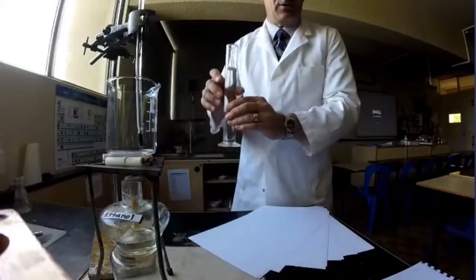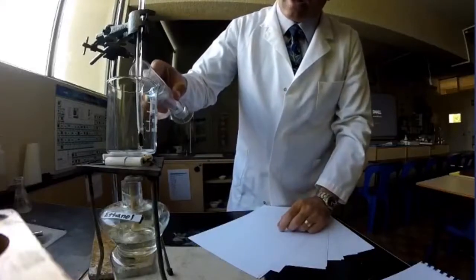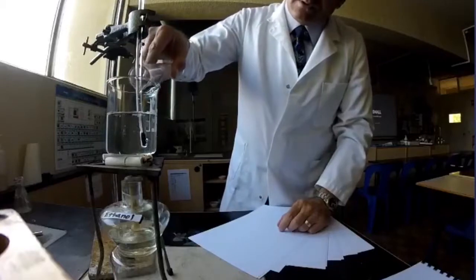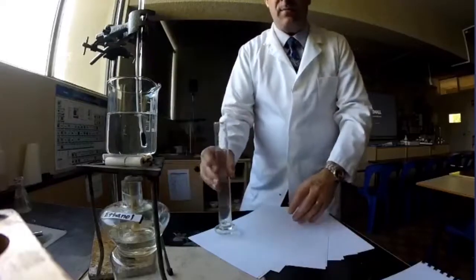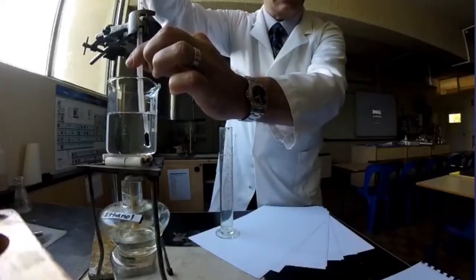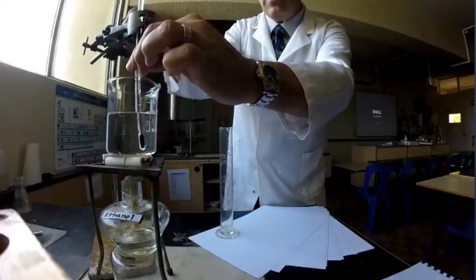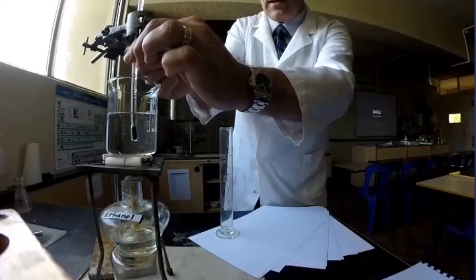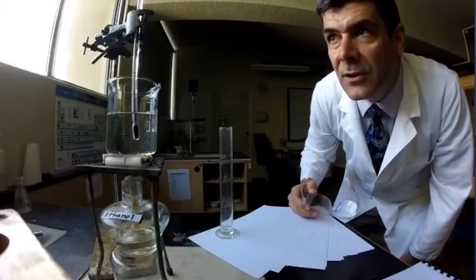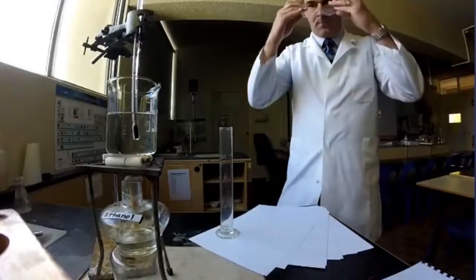The second thing I've done is to measure exactly 100 mLs of water. I'm going to add that to my beaker. And I also want to measure the starting temperature. So I've got my thermometer in here, which you may or may not be able to see, facing the opposite direction. But you can see there. What I need to do first of all is record the starting temperature, and I can tell you that my starting temperature is 23 degrees C, 23 degrees.